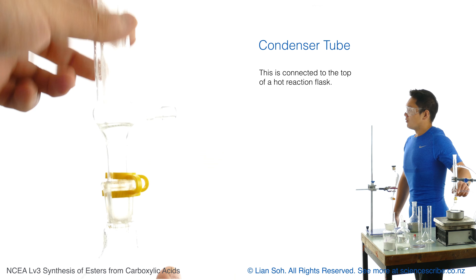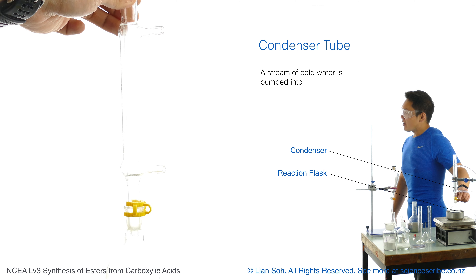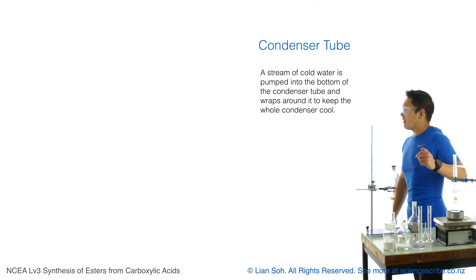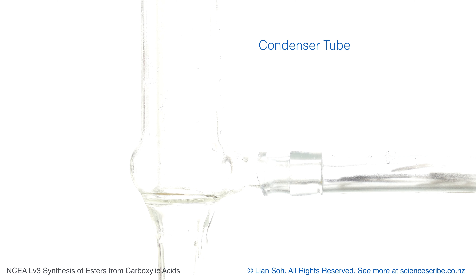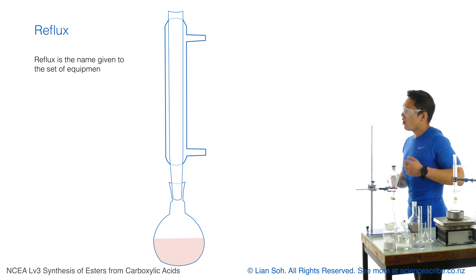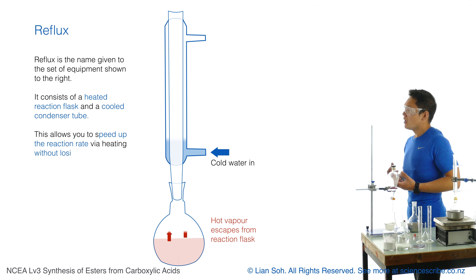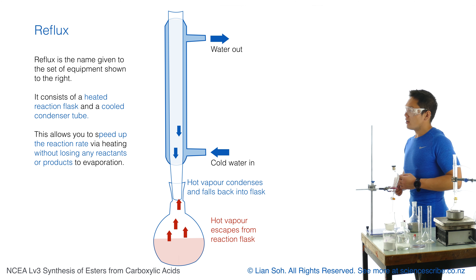The condenser tube does exactly what the name says — it recondenses things, in this case the vapors that try to escape through the flask. On the outside of the condenser tube is a second layer of glass, and cold water is pumped in at the bottom, circles around the inner tube, and escapes from the top. This keeps the top part of the flask cold, so any hot vapors which try to escape recondense back into the flask to either complete the reaction or remain as the product we want — in this case, the ester.